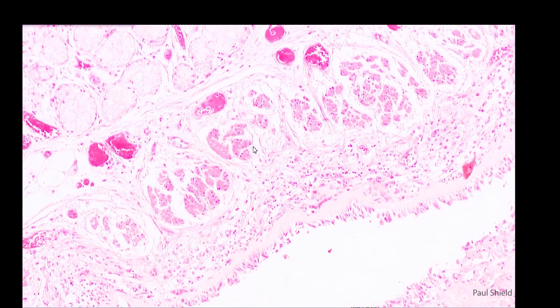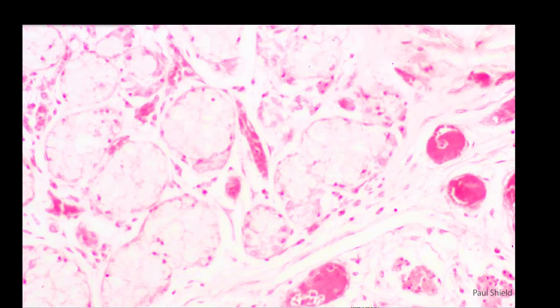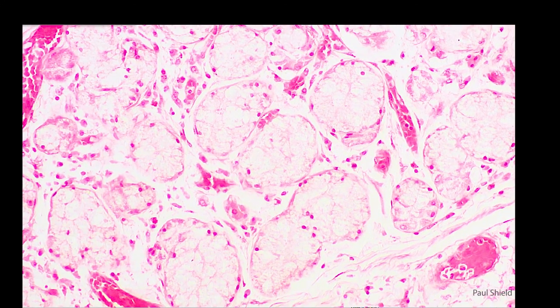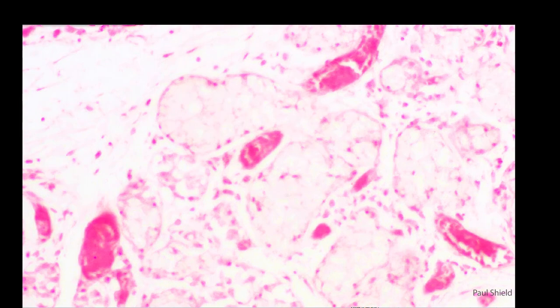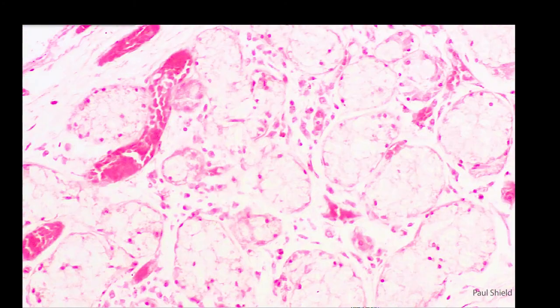And just above that, they're not staining very darkly, but these are submucosal mucin glands that have undergone hypertrophy as well. And just going to high power, you can barely see them, they're very clear, like goblet cells. They have nuclei arranged around the periphery of the gland, and often you'll see a hyperplasia of those as well, helping to contribute again to all the mucus that you see in asthma.